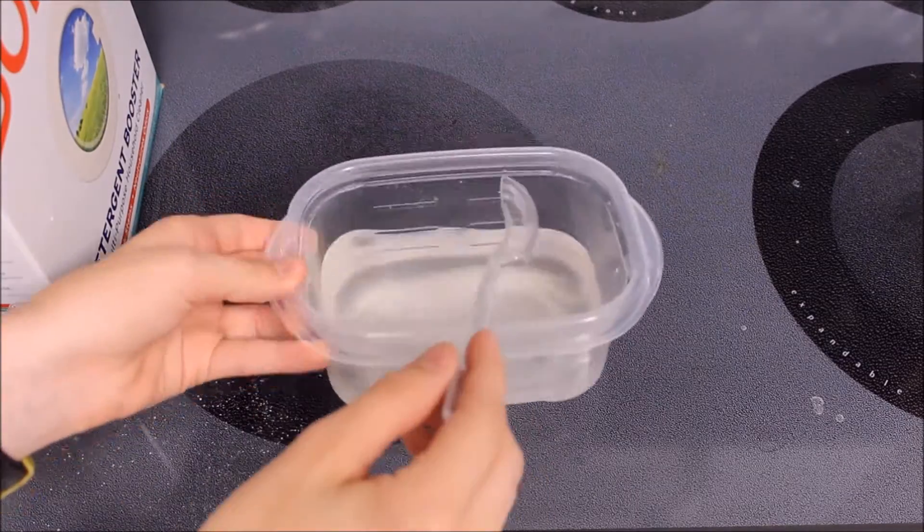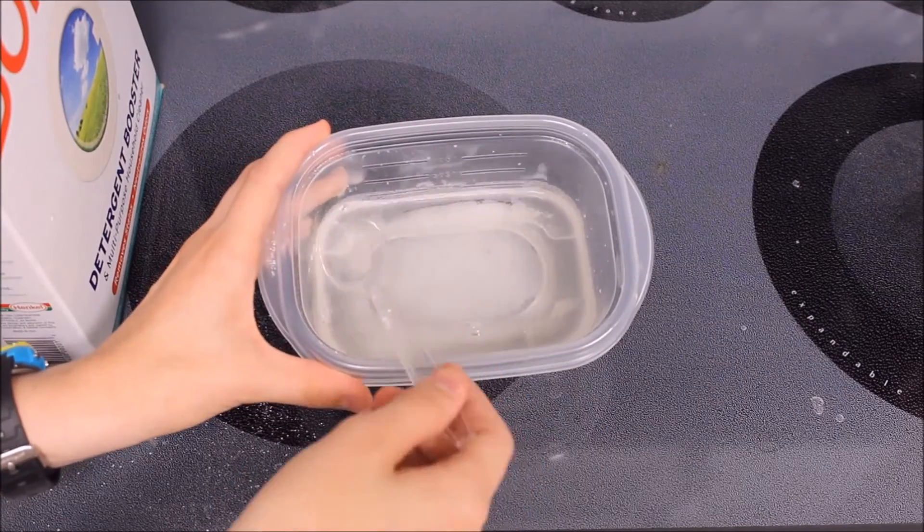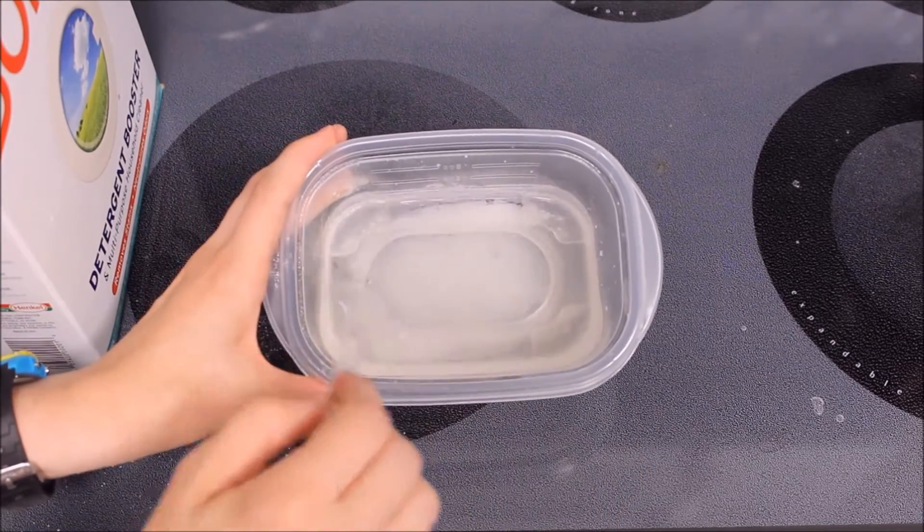20 minutes later... Now that our solution is at room temperature, we will measure out 30 milliliters. The sodium borate crystals that have formed at the bottom can be discarded as we do not need them.